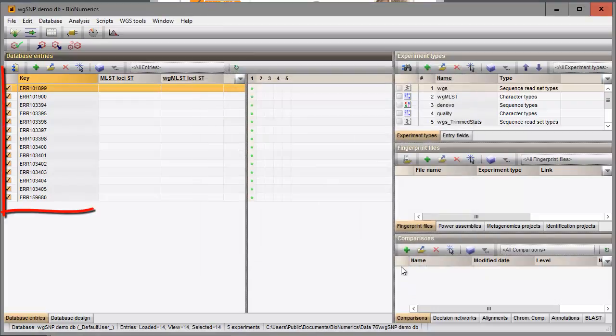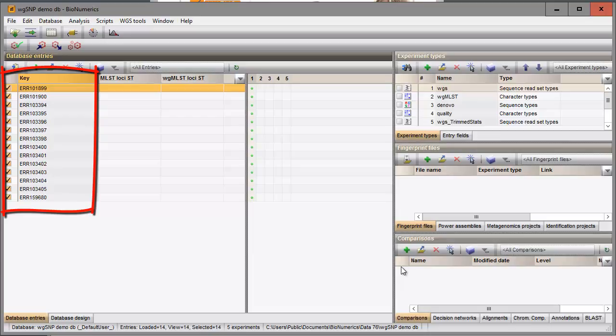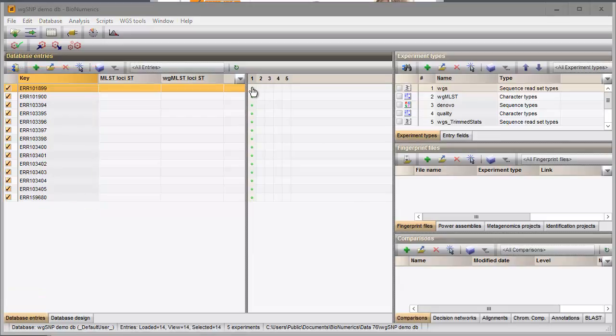14 entries are created and the accession codes are stored in the key field. When I click on one of the green dots in the first column the link status is shown.